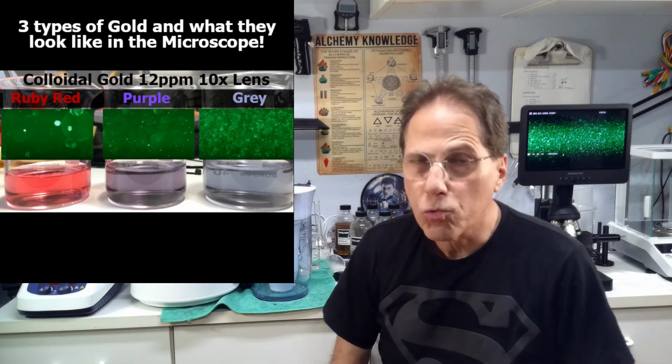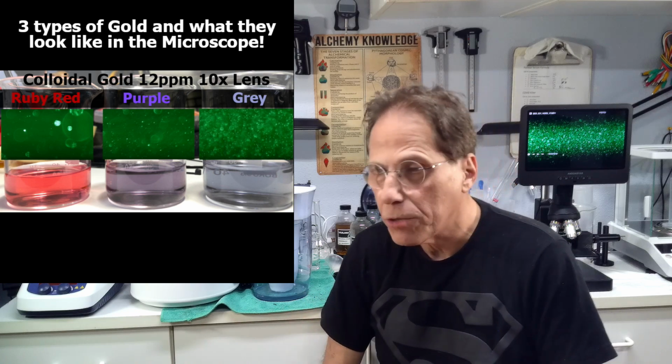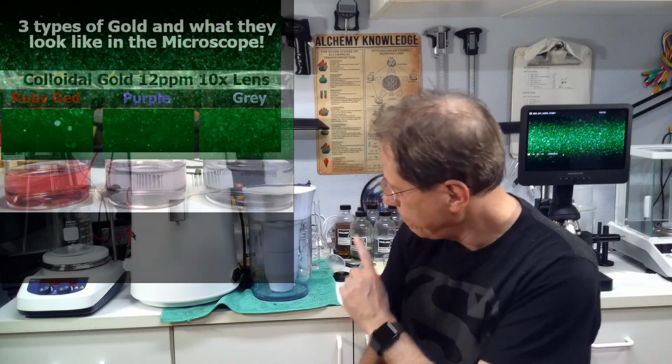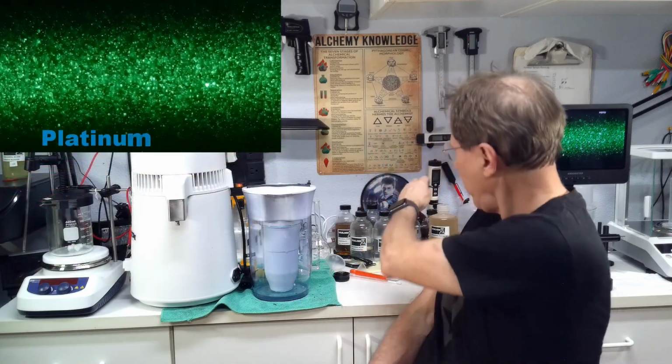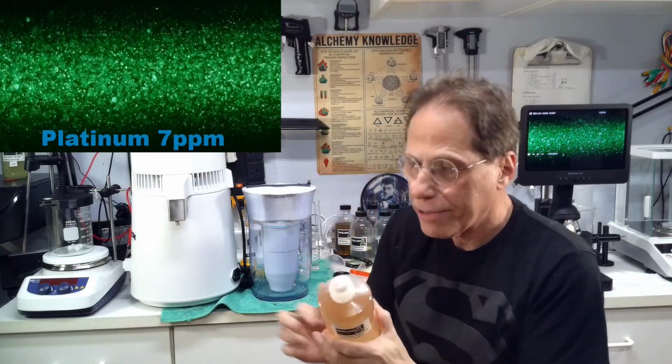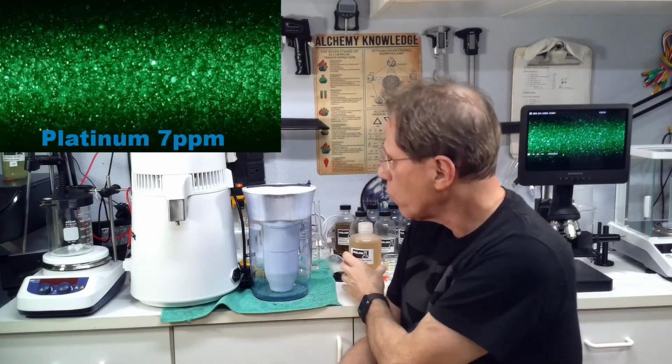It didn't exactly get the perfect ruby red that I wanted out of it. Gold really wants like 0 parts per million water, but silver, zinc, and all the other things, even platinum, which I have right here. Even platinum, I tried RO water, and it kind of worked as well, too.